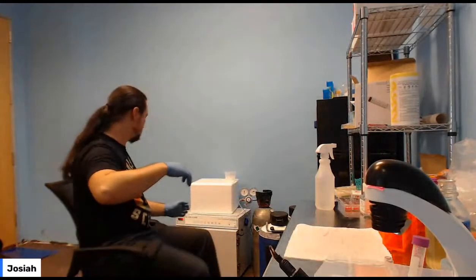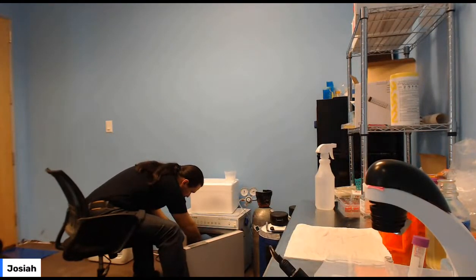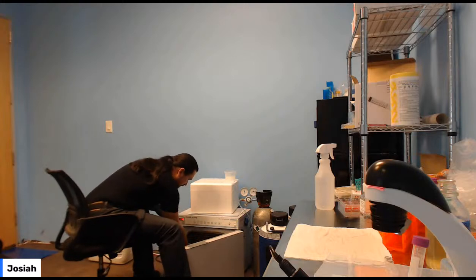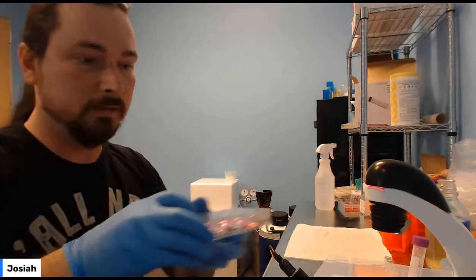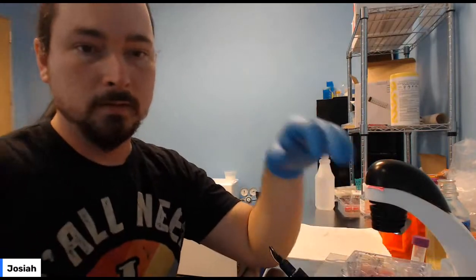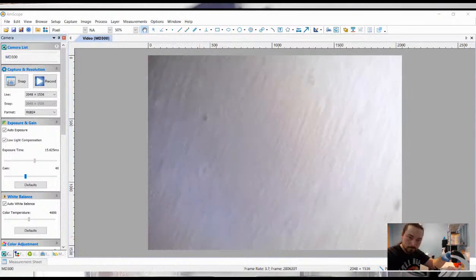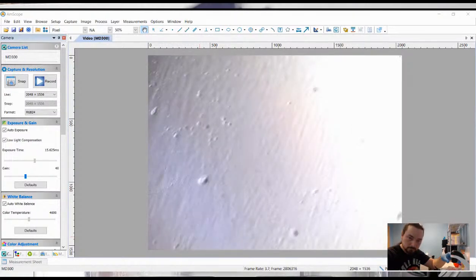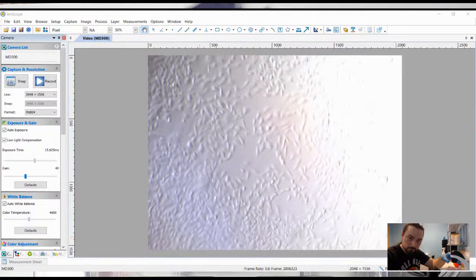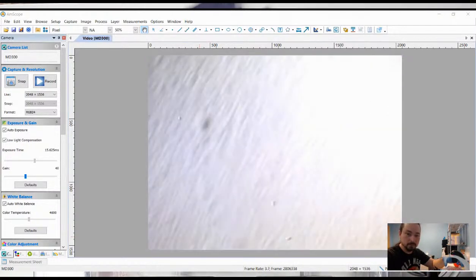Grab it. And you're going to look at it. Wrong side of the plastic. There we go. Okay, so this is one of the wells.